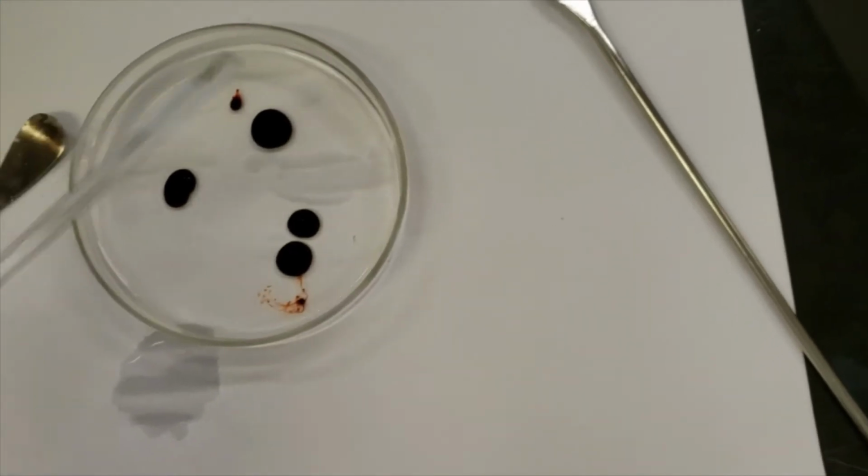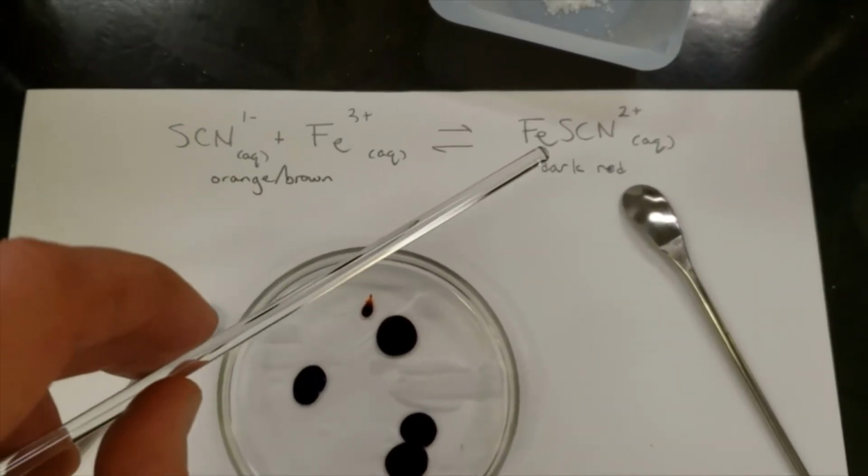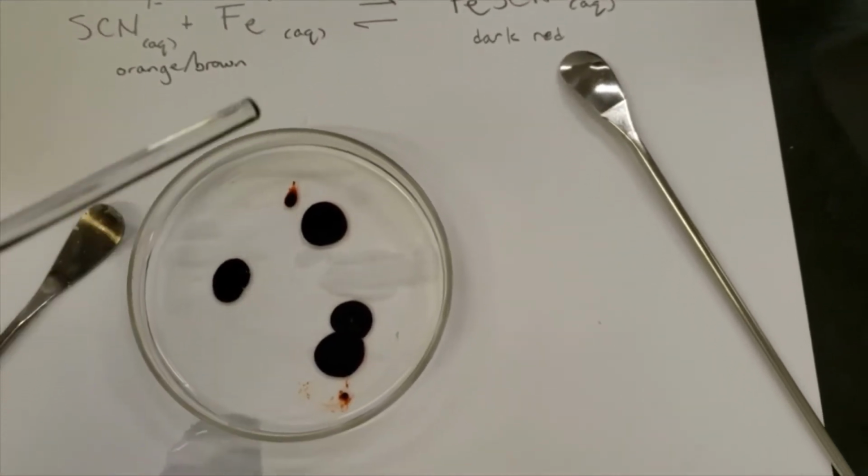So you can see the dark red that's forming there, and that is the iron thiocyanate complex that is forming.